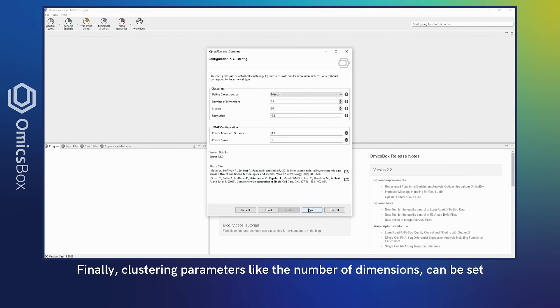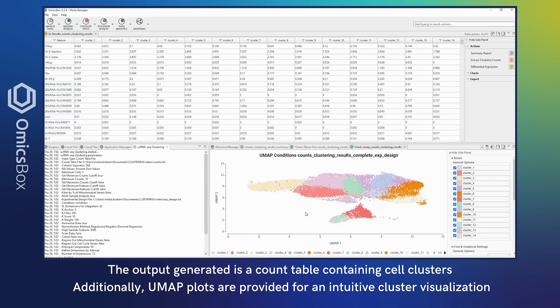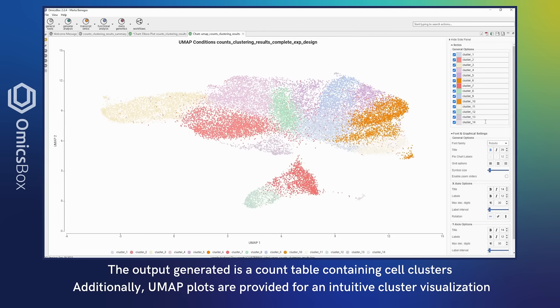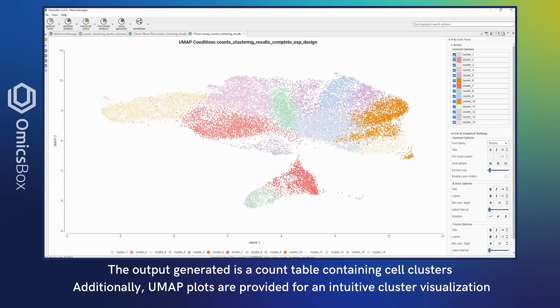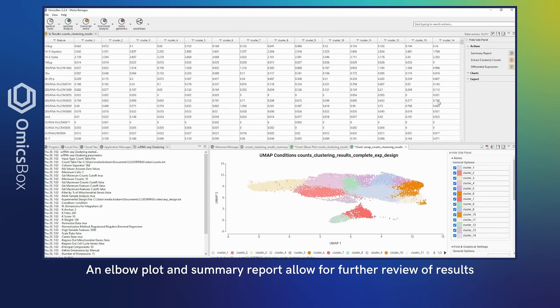The output generated is a count table containing cell clusters. Additionally, UMAP plots are provided for an intuitive cluster visualization. An elbow plot and summary report allow for further review of the results.